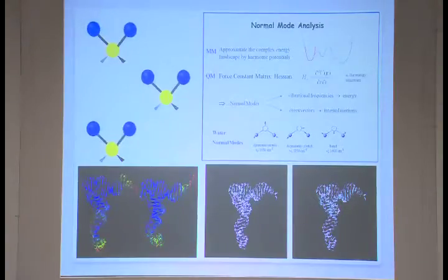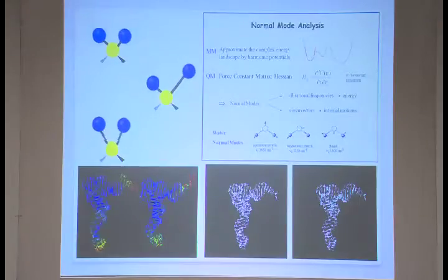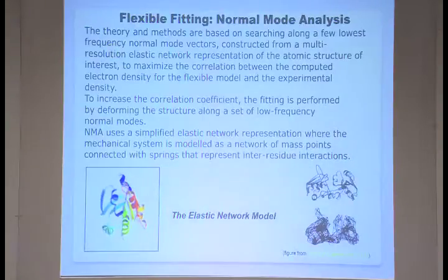But during this fitting course, we really found that they are very, very flexible, and they can really mold themselves in different ways to go through the inter-subunit space and all this. So this normal mode is actually this elastic network where each amino acid, you can just think of a ball or the C alpha atoms, and then it is bonded with another one, and it's just vibrating, that model.